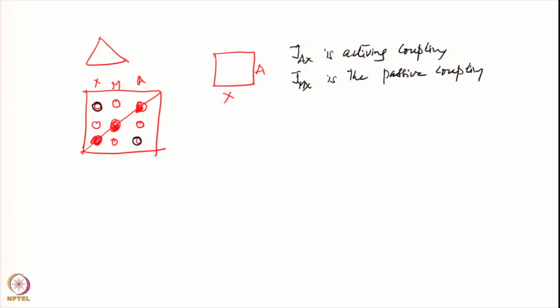Accordingly, one can draw the various structures. Now, suppose I take a different cross peak. Let me say I take this cross peak. What is this cross peak? This cross peak is M on this side, because this is all AMX. If I am taking this cross peak, remember I am not taking this. When I draw here M, if I draw here X, then it is this cross peak.